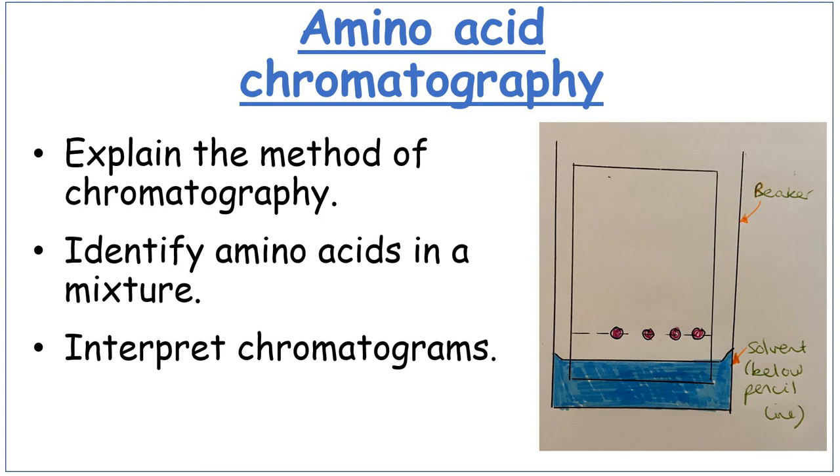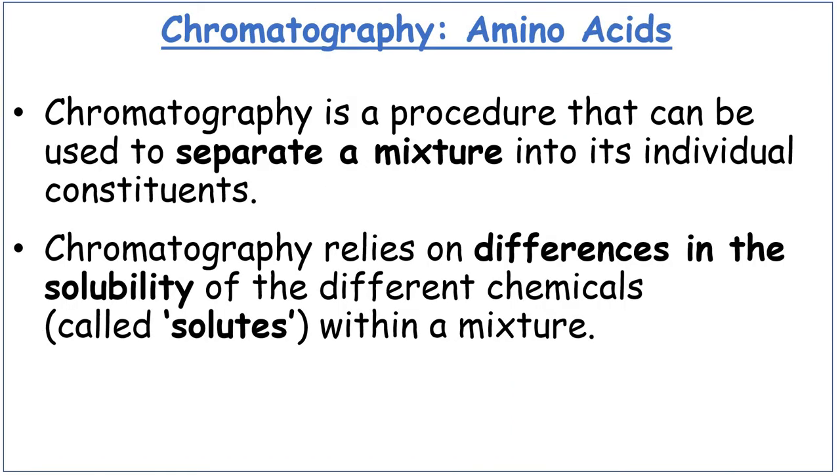Amino acid chromatography. By the end of this video, you should be able to explain the method of chromatography, identify amino acids in a mixture, and interpret chromatograms. So, chromatography of amino acids.